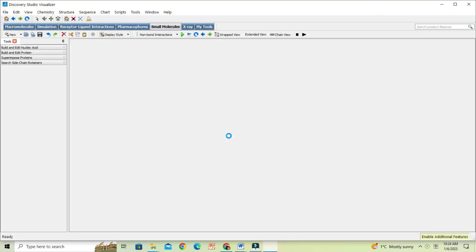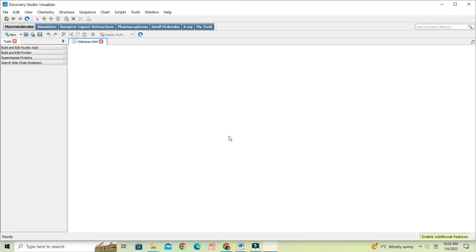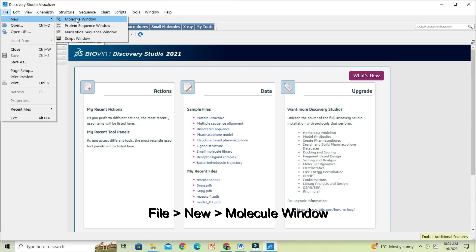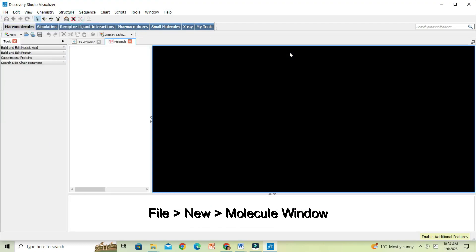Click File, click on New and open a new molecule window. Now I will drag the protein molecule to the molecule window.